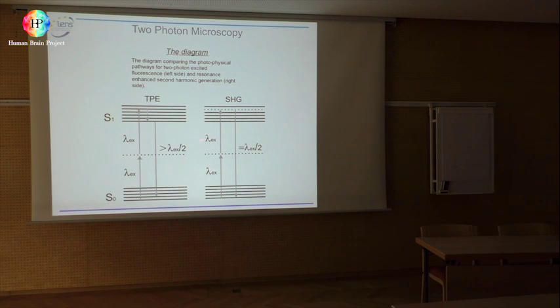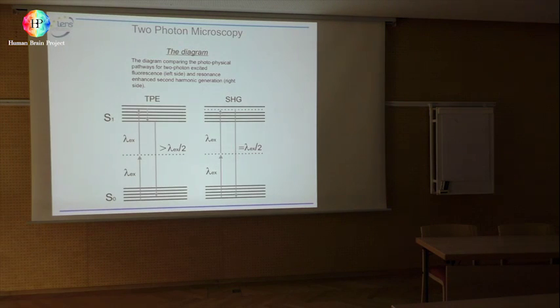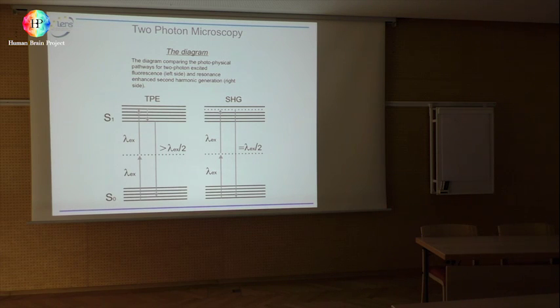Here, this is not the case, because this is an incoherent process, because here the photons remain for a certain time, which is called the lifetime of the level, and the phase of this photon is completely random. So what does it mean that the phase of this photon is not random? That you may have some coherent effects. You may have those photons interfering constructively in second harmonic. And if the second harmonic chromophores are aligned in the same way, you are adding a strong second harmonic generation signal.